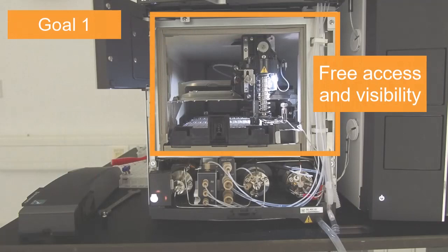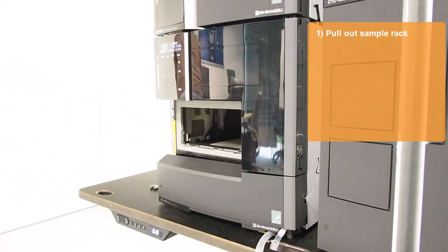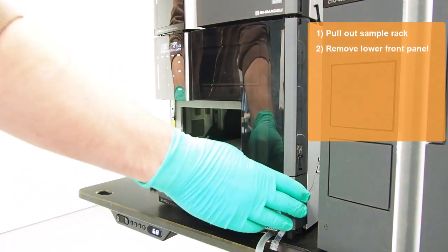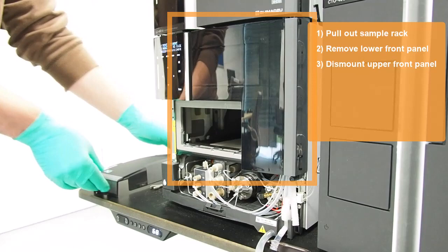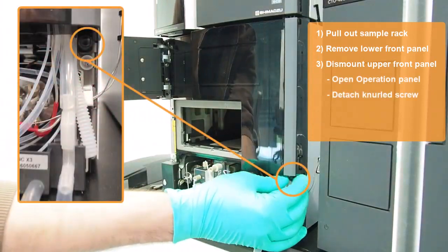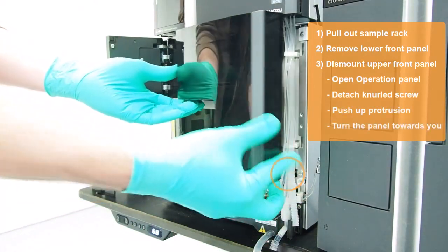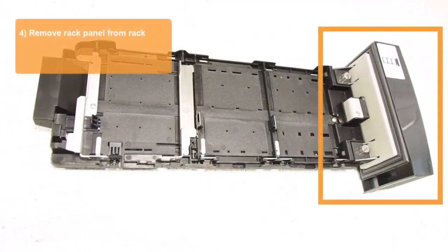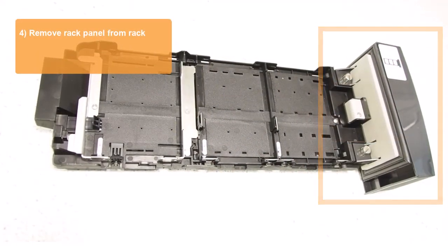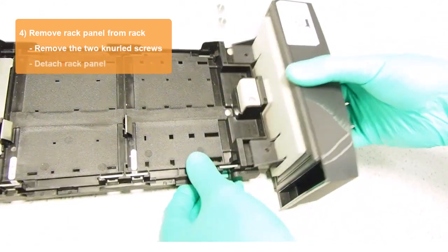Our first goal is to ensure free access and visibility to the inside of the auto-sampler. Pull out the sample rack and set it aside, then remove the lower front panel. Open the operation panel and attach the knurled screw at the bottom right. Push up the protrusion and turn the upper front panel towards you to remove it. Now remove the rack panel from the sample rack by turning the two knurled screws and removing them.